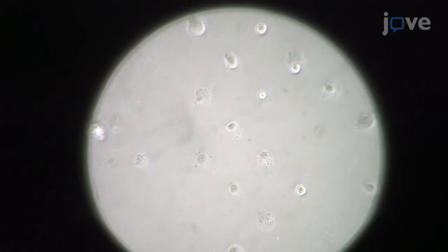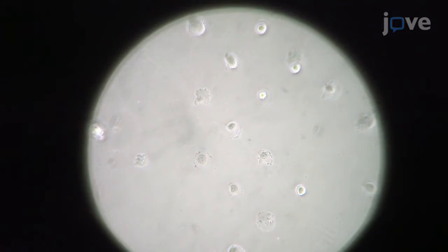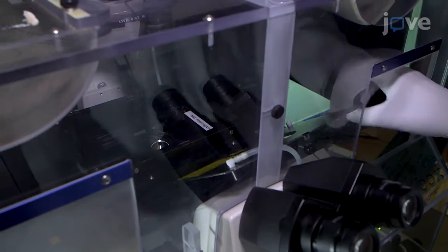Although our imaging and analysis protocol is straightforward, it requires the generation of single cells that are well spread on adhesive micropatterns. In this video, we will demonstrate how to culture cells on micropatterned coverslips and how to visualize and analyze secretory events using spatial statistical tools.